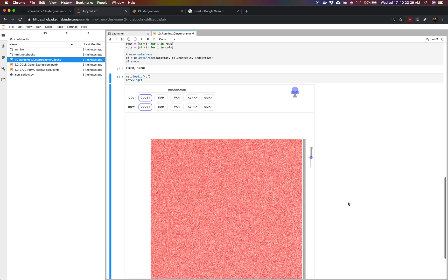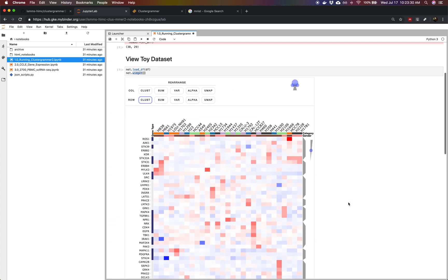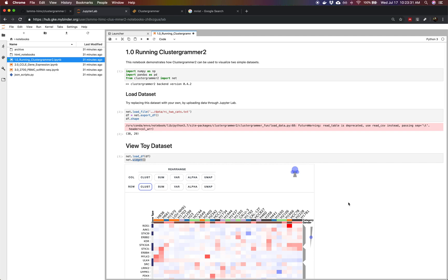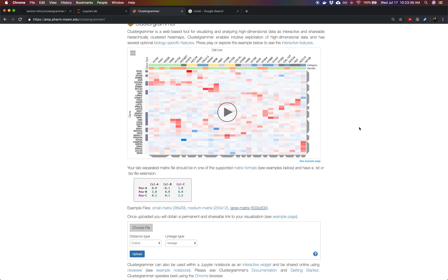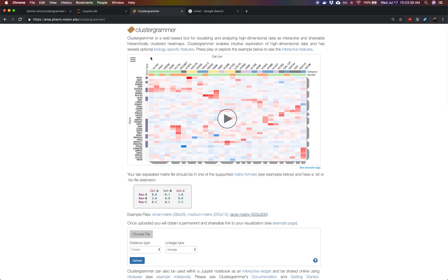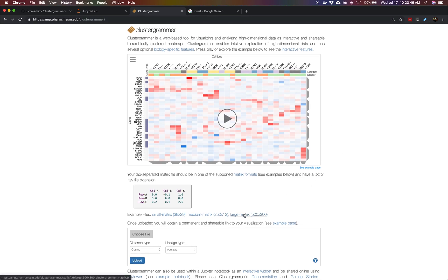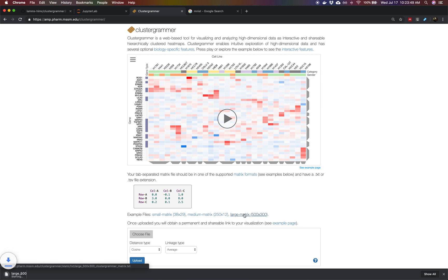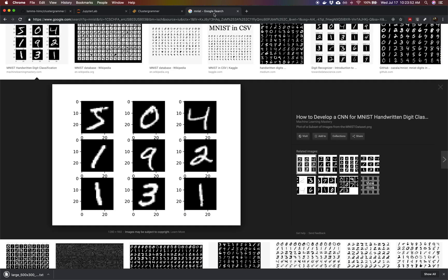One nice thing that we can do using JupyterLab is actually upload our own data onto the cloud. We're going to go and obtain another dataset from the ClusterGrammar web app. If you look for ClusterGrammar web, you'll see this web application.